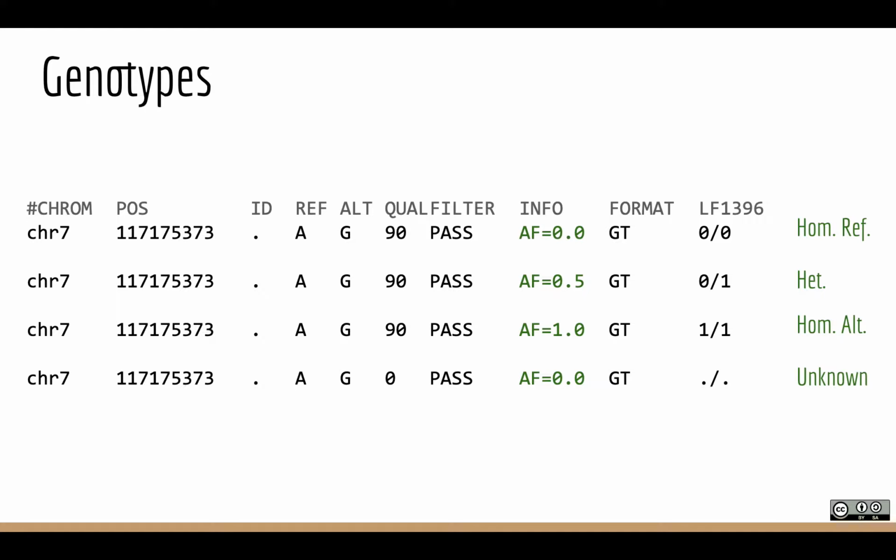So it can be very confident about the genotype of 39 of us, but GATK might say, well, I actually see 0 sequencing reads for, say, me. And therefore, the genotype for me is probably going to be dot/dot. And the dot here represents, I don't know. I'm punting. I'm not going to make a prediction because I just can't be confident about it.